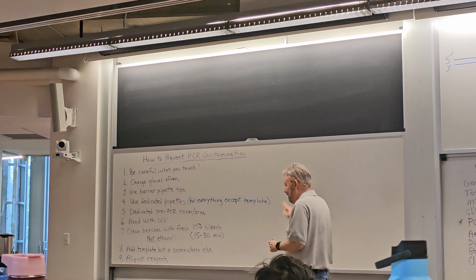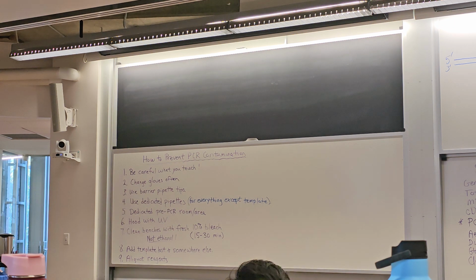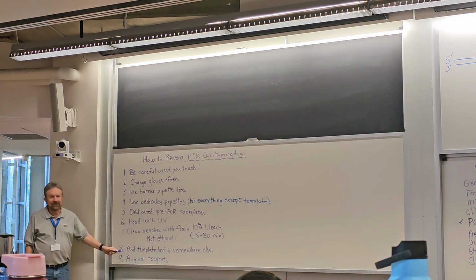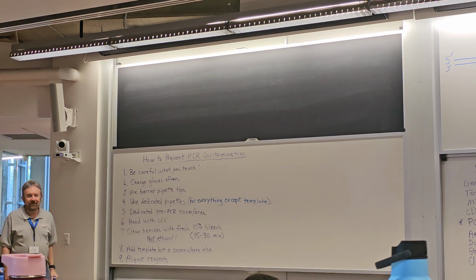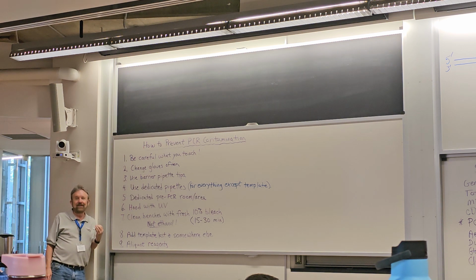Now, in my lab, which is across the hall from where your labs are, often what we'll do, if we're having any contamination issue at all, is I'll have my students just go across the hall to the teaching lab and set it up there. I'll set it up in our lab. That's kind of a terrible place to do it. And a lot of times that takes care of the problem. Okay, so add the template last, always last, and somewhere else, not your pre-PCR room for sure, because you don't want that room contaminated.